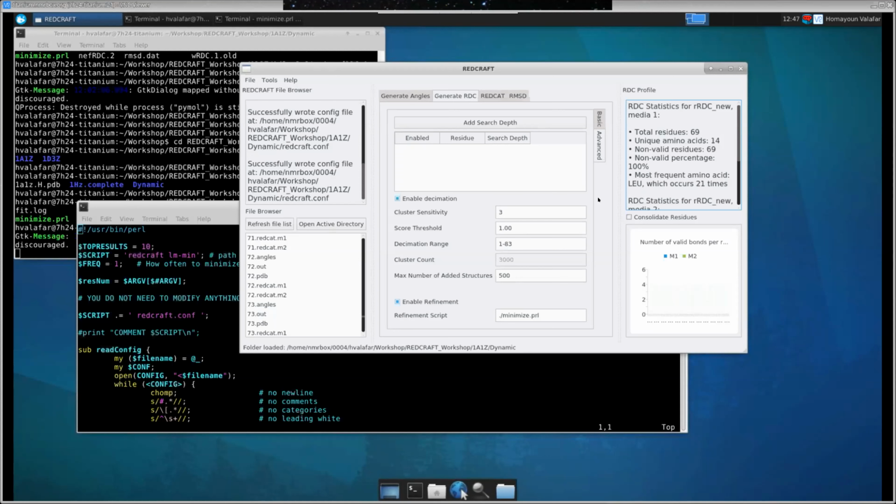What I have managed to do here, I hope, is make analysis of RDCs a point-and-click kind of thing, even if you don't care to know what's underneath the hood, but connecting it with other things becomes a hassle. By asking for additional funds, which is not very much, I'm hoping to make that both opaque and transparent at the same time, to really inject it into a workflow. Good. Let's plan on having an offline discussion on some of these topics.